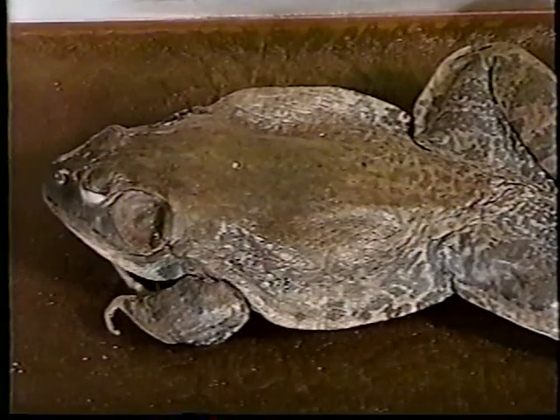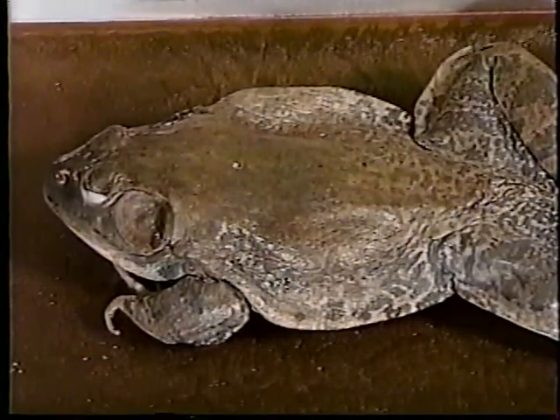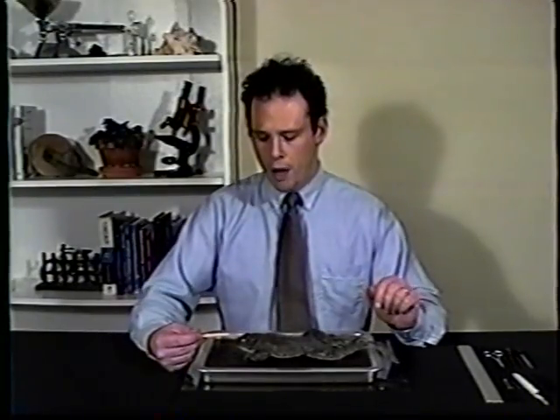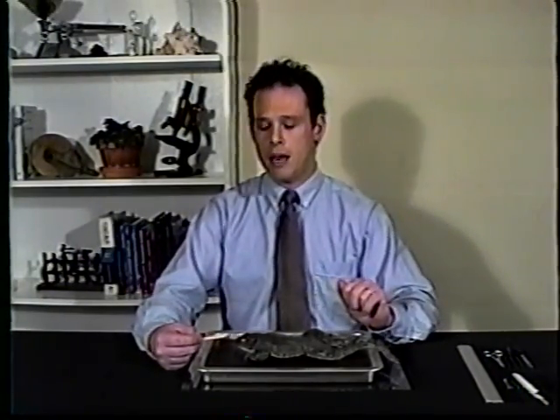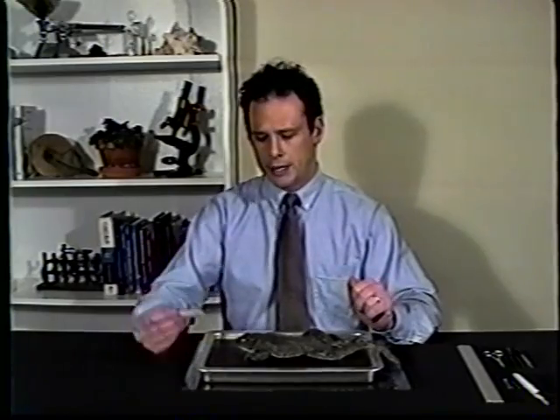Now let's examine our specimen's eyes. A frog's eyes are located on the dorsal side of the specimen. This allows the frog to be completely submerged in water and still view what is going on around it. This is an excellent tool for both hunting and escaping. Now let's look a little closer and let's examine the eyelids that protect the eye of our specimen.